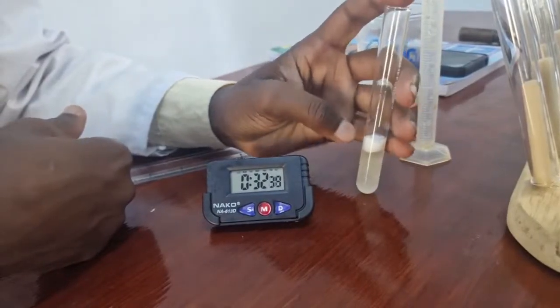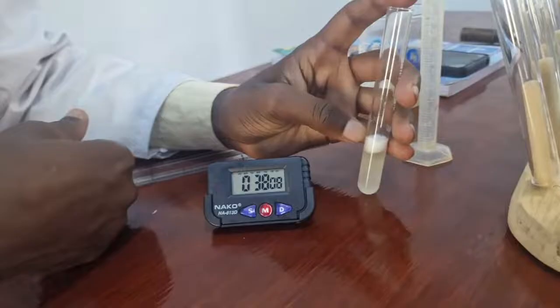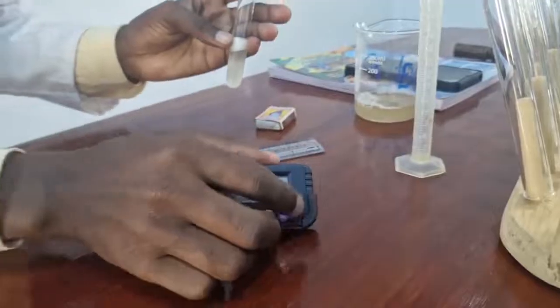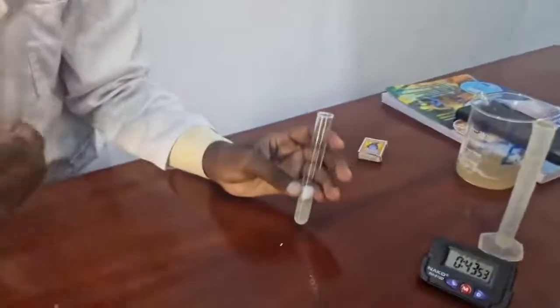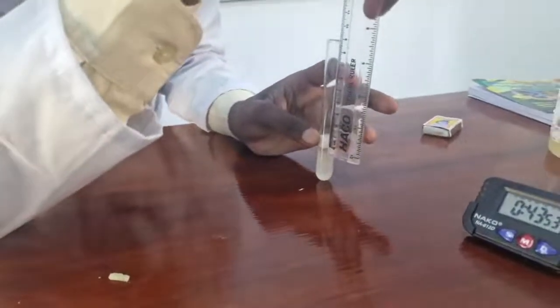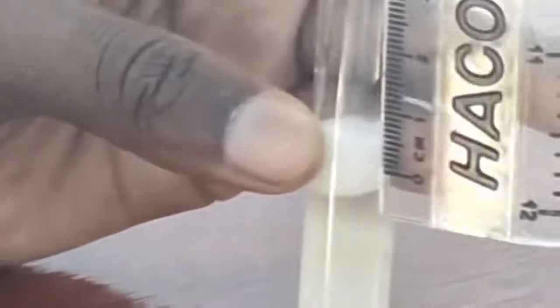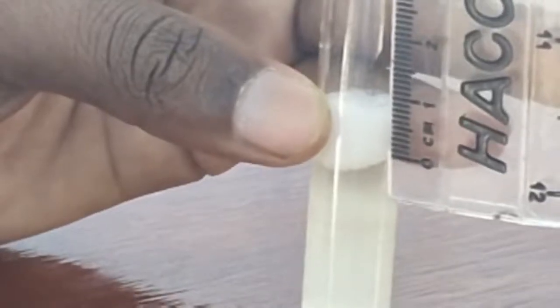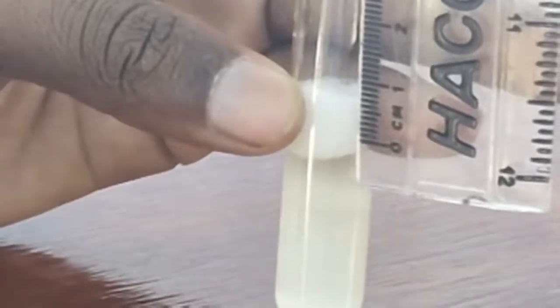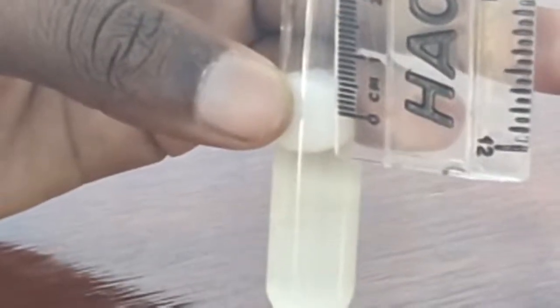So I'll hold where the froth ends. So this is with sodium hydroxide. There, I think we can see. I've held where the froth has ended. So I'll measure the length of the froth. I'm measuring the length of the froth. I think we can see from the point of the solution to where the froth is, it is almost 1.